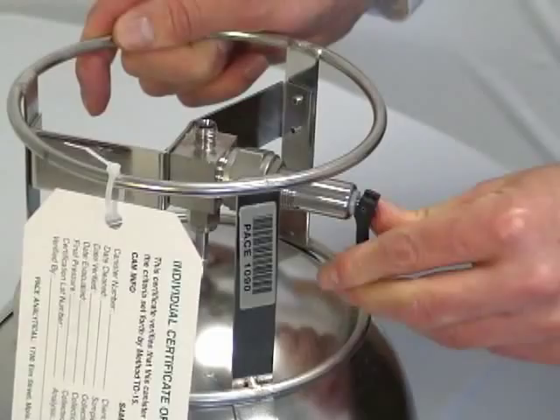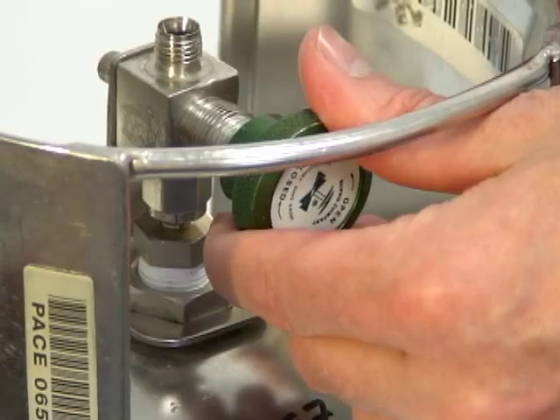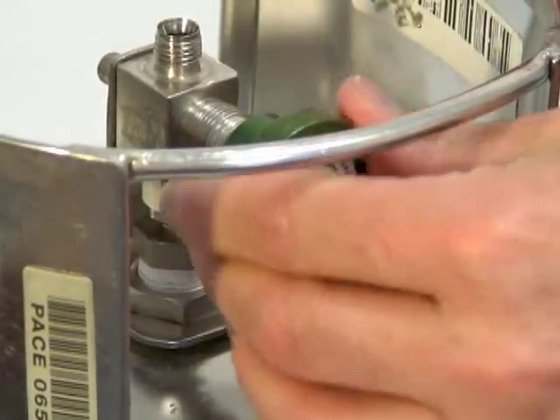For the toggle valve, you will flip the valve back down. For a rotary valve, simply rotate it clockwise until closed.